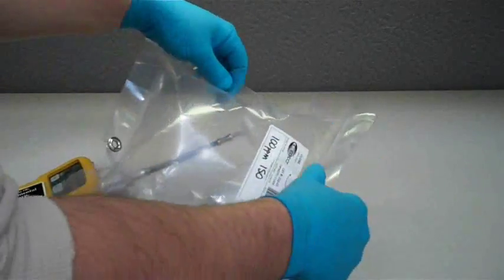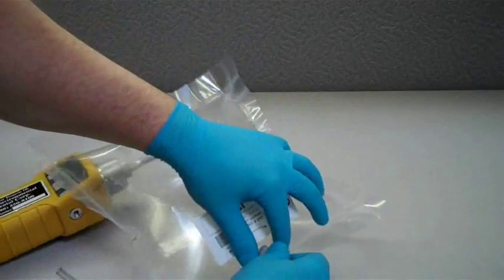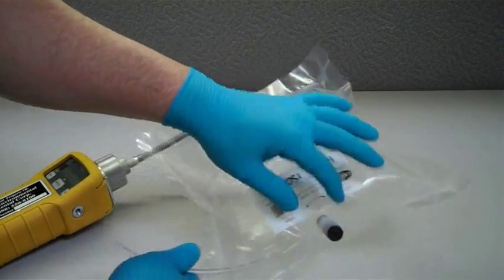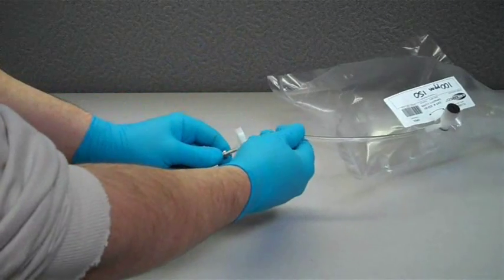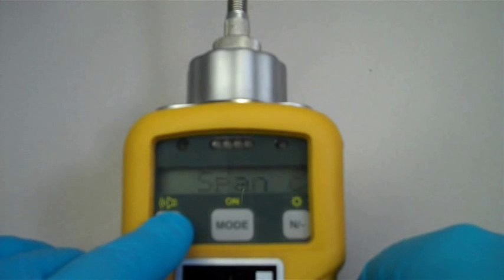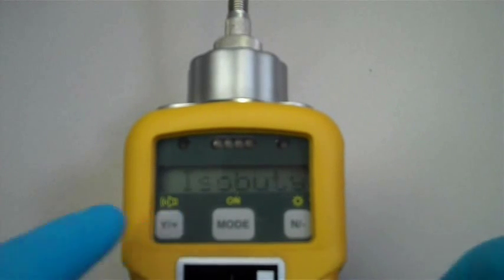Once the fresh air calibration is complete, open the valve on your Tedlar bag and make a secure connection to the probe tip of the unit. The display will read span cal. Press the Y button to start the span calibration.